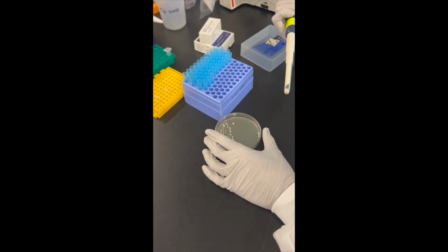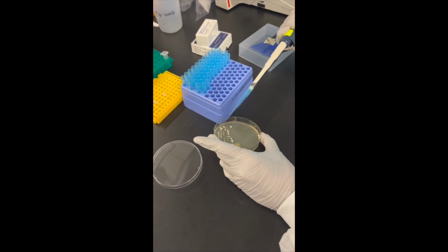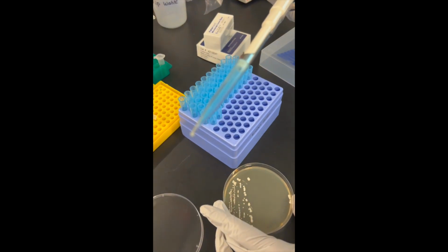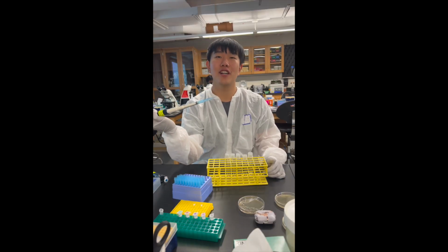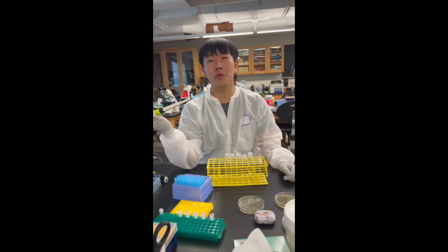First, we will now obtain our wild-type yeast strain. Look at how pretty it is. This pipette tip contains over 10 million yeast cells, but because this is too many, if we plate it, the plate will become overcrowded. So what we'll have to do is a serial dilution down to 10 to the 3 cells per milliliter.